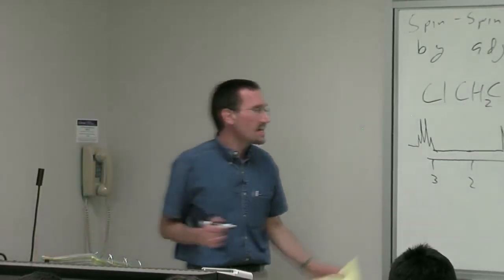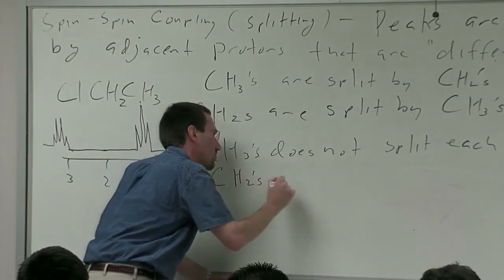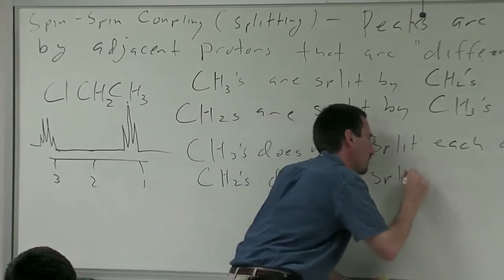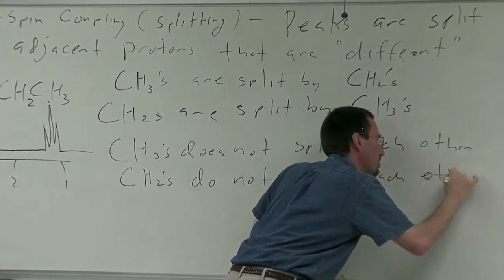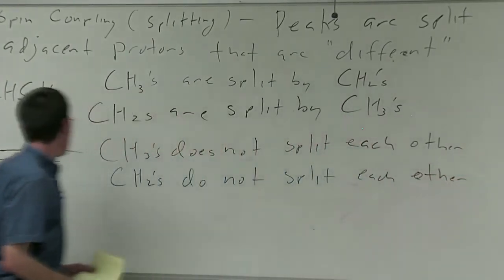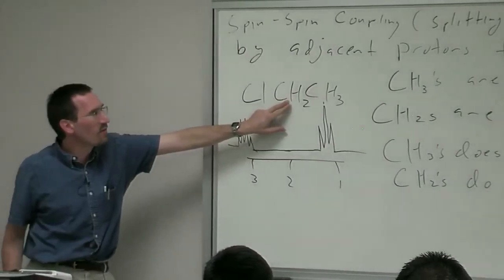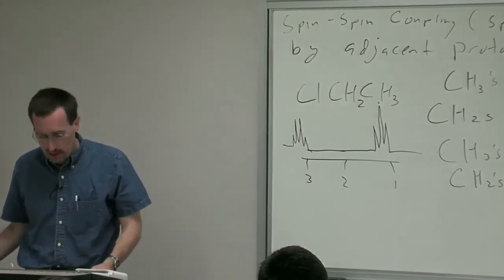And then I'll say in this particular case, the CH2s do not split each other. In other words, in this particular case, the 2 hydrogens of the methylene group are the same, so they don't split each other.